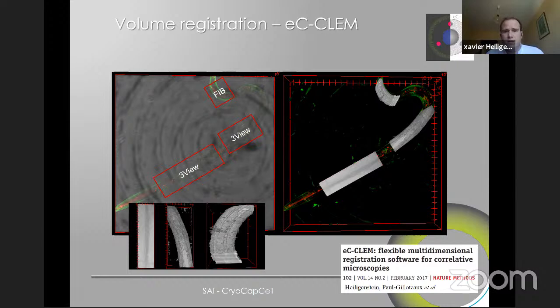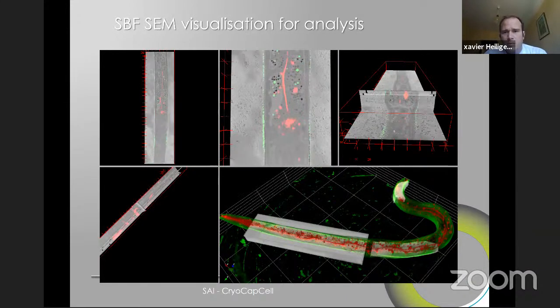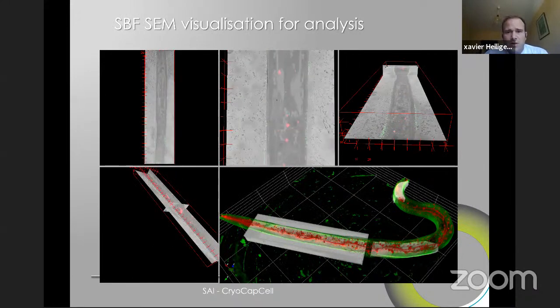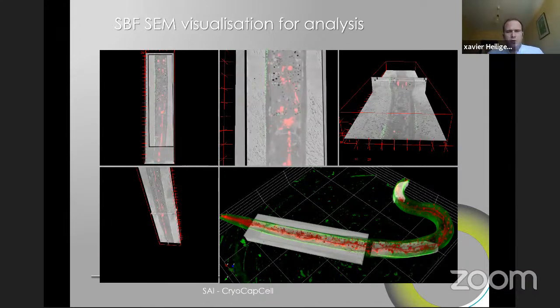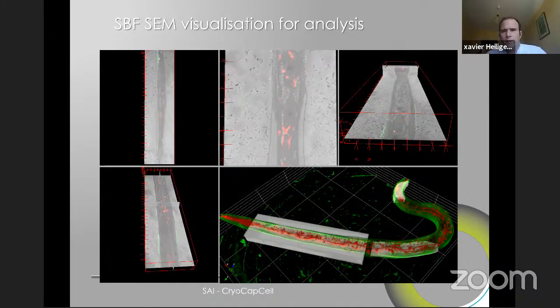And then this is the kind of images you could get, where the fluorescence is perfectly overlapping with the electron microscopy. And so you can start to do precise localization of your fluorescence signal inside your electron microscopy block at high contrast. So this is really what we were aiming for, to develop the complete workflow.